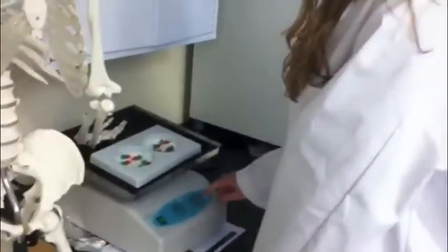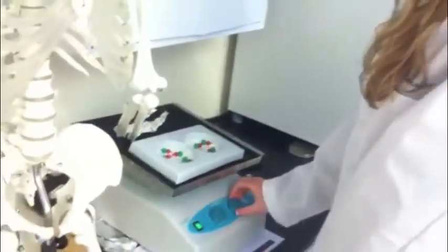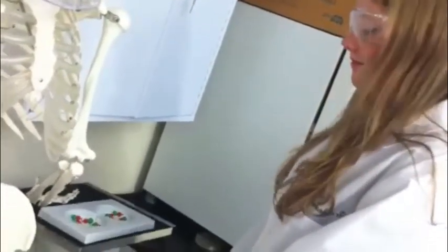Next, we have to put the termites on the gyro twister. Don't forget to plug it in! Set it to a desired elevation.